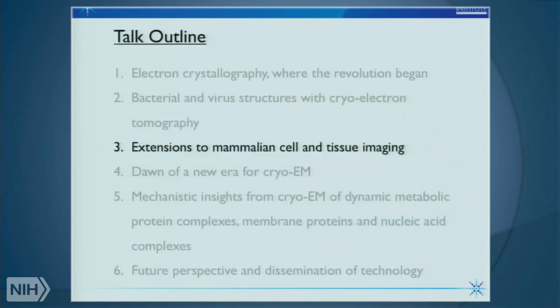So far, I've spoken a little bit about electron crystallography and the contribution of tomography to bacterial and virus structures. But I want to digress slightly to talk about the direction we took several years ago to adapt electron-based imaging methods to look at much larger things.